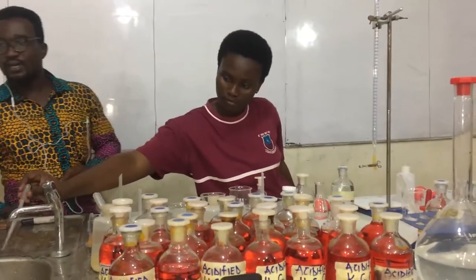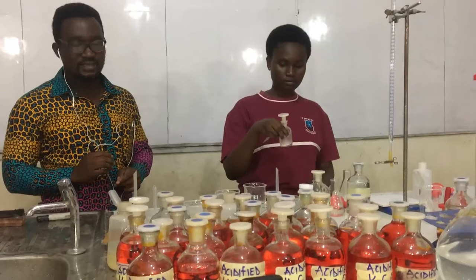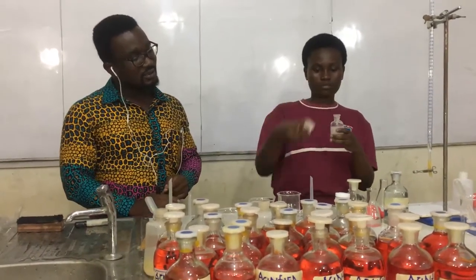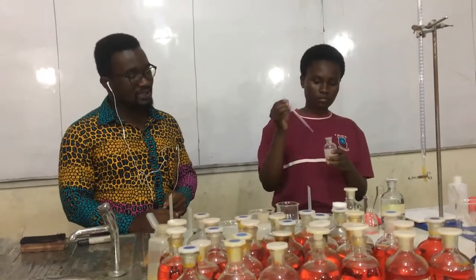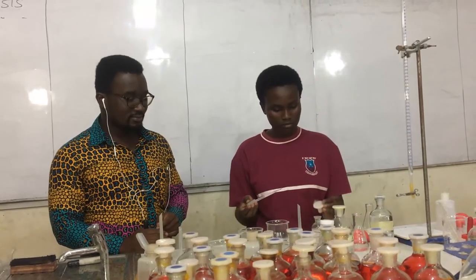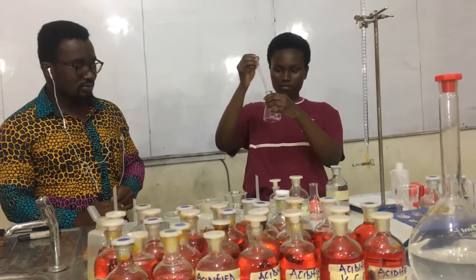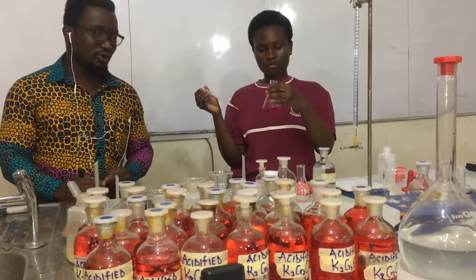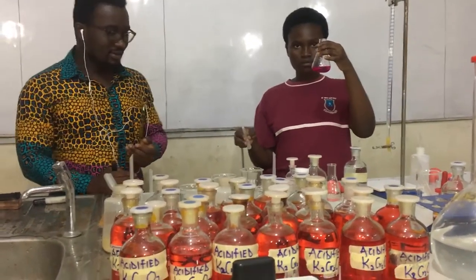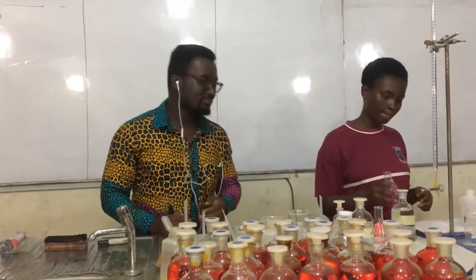This time, she has also sterilized the dropping pipette nicely. She's going to use that dropping pipette to also pick a few drops of the phenolphthalein. So she added only two drops. It can be three. It can also be two, depending on how you want to go through your titration.